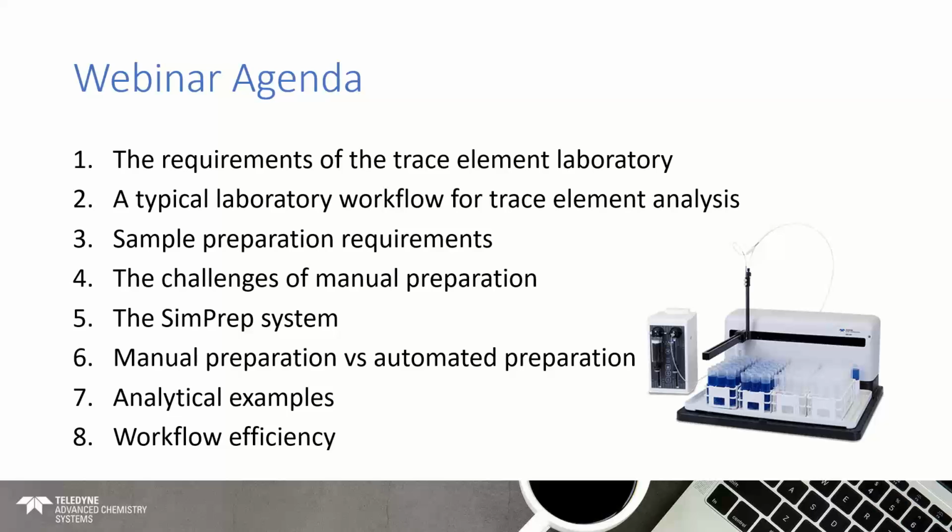So to start with, just an agenda for this webinar. I just want to go through what we'll be going into. I'll be discussing some general requirements of a trace element laboratory. I imagine this will sound quite familiar to pretty much everybody on this webinar. I want to go through a typical laboratory workflow for trace element analysis, and I always find referring back to the workflow is very helpful.